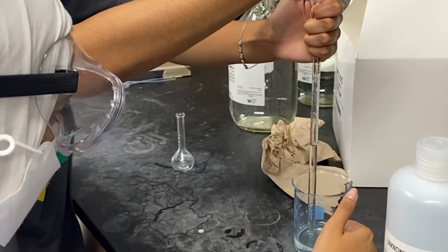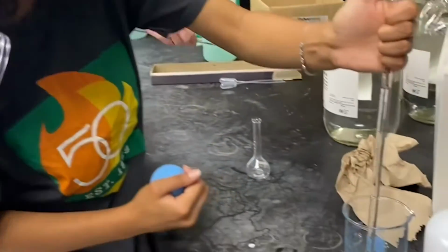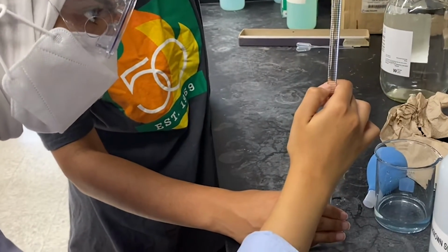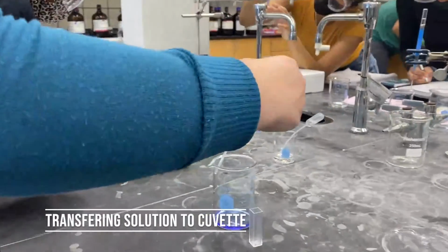The next step is to prepare the unknown solution with the same dilution steps. After that, transfer all the dilutions, stock, and unknown into the cuvettes with a plastic pipette. At this part of the experiment, you should have 6 cuvettes: a blank solution with water and ammonium, stock solution, dilution 1, dilution 2, dilution 3, and the unknown.